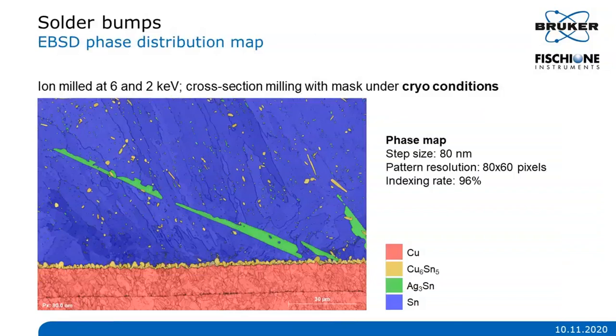Thank you, Pavel. Someone is asking if we have good quality patterns with samples prepared by FIB for the conventional EBSD technique.